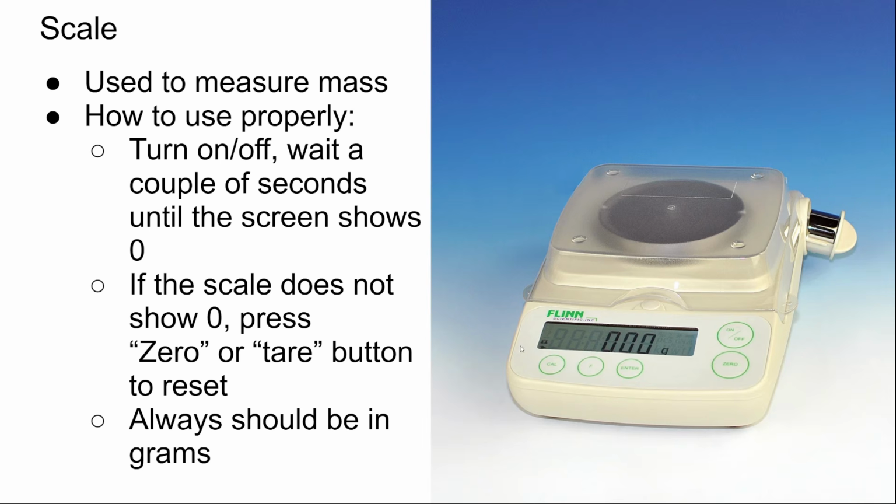And then lastly, it will always be in the measurement of grams, or g, on the scale. Obviously, if it doesn't show grams, or shows a different unit, please let me know. I will fix the scale for you so that you can actually use it properly.